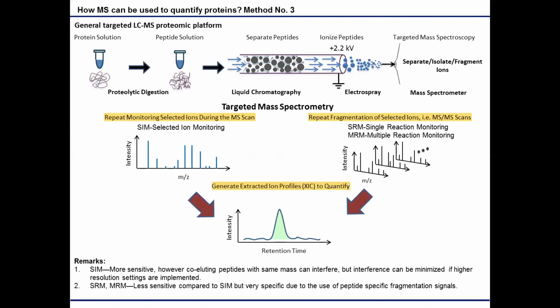This is something that is inherently different than quantitation by high throughput sequencing. I want to take a moment to mention that, because we spent a lot of time talking about quantitation by high throughput sequencing. Quantitation by high throughput sequencing uses read counts, so you just count the number of times that you see a molecule.